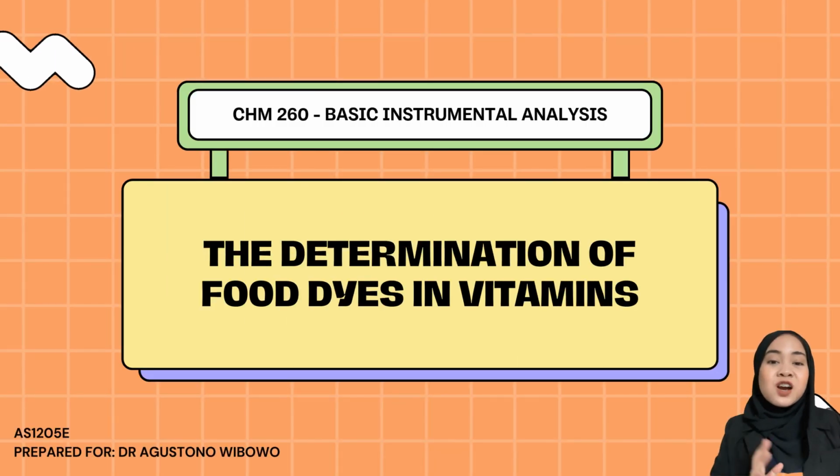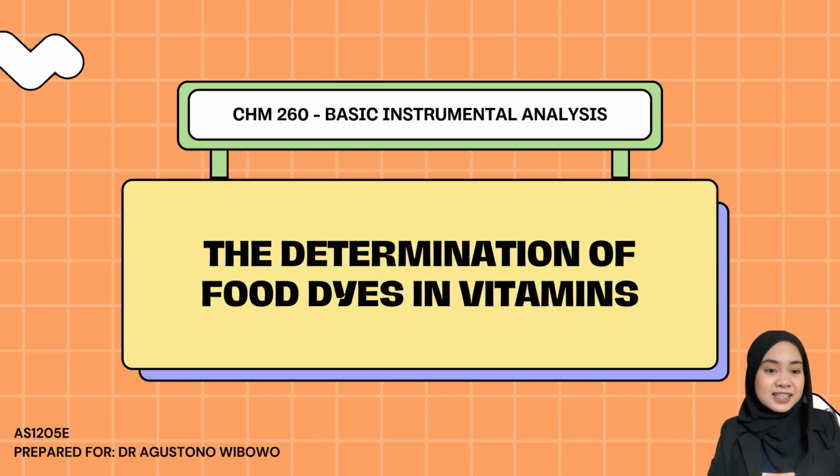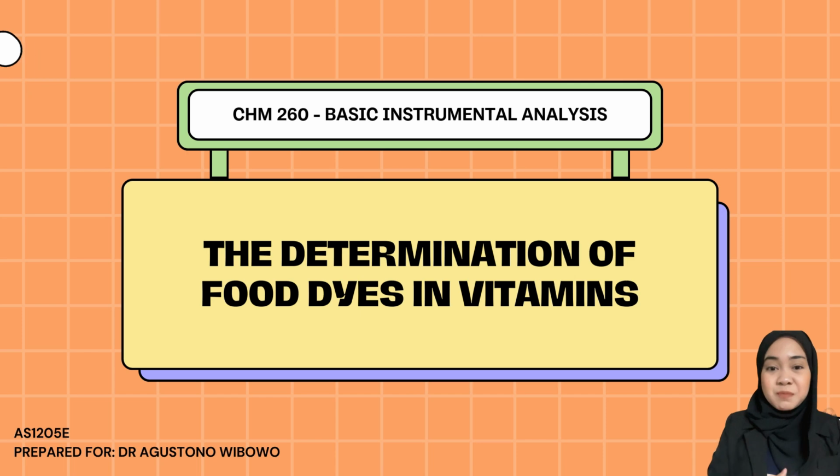Assalamualaikum and hi. We are from class AS1205E and would like to present about the determination of food dyes in vitamins using HPLC.